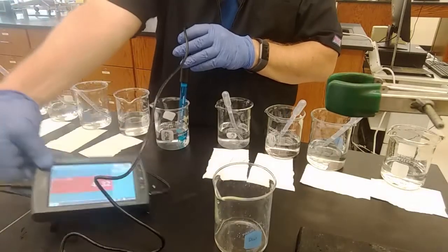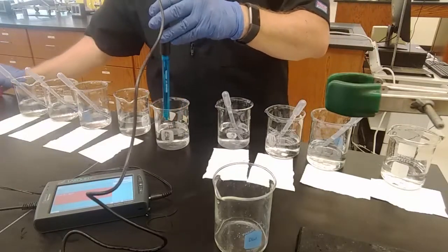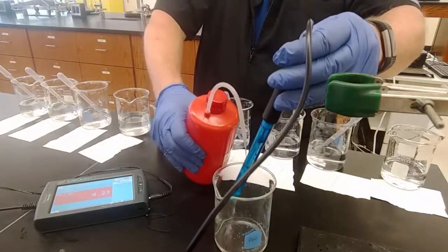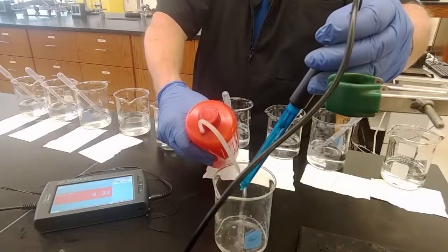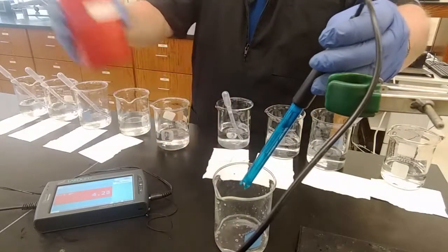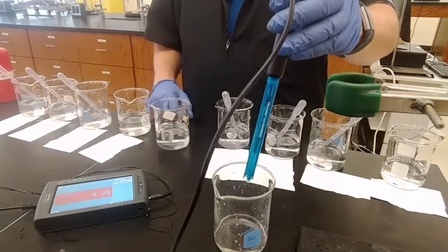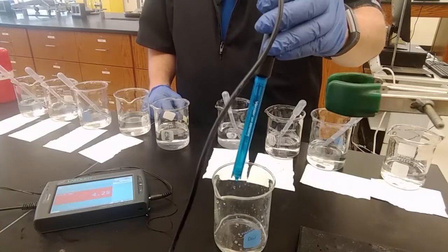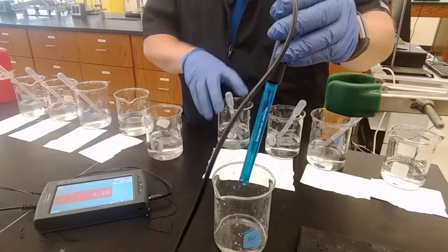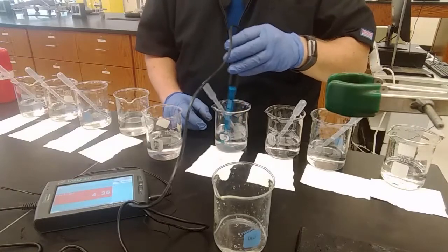Let's see what happens as we go to the acidic direction. A minute of rinse, especially the tip, which is where the actual reading is, the actual probe is. All right, so 4.25 for our pH 7 theoretically solution. Let's see what we get at pH 4 that we were thinking was pH 4.